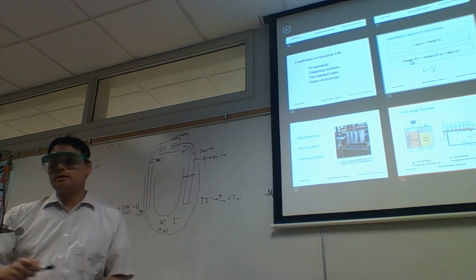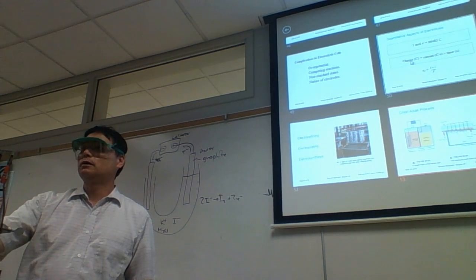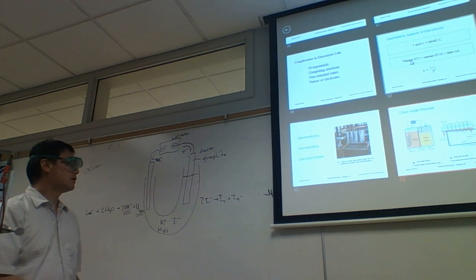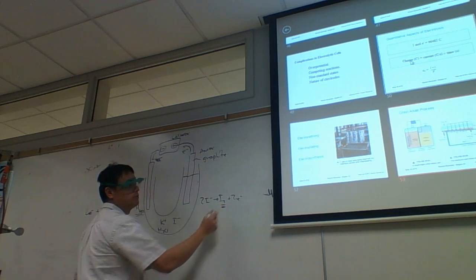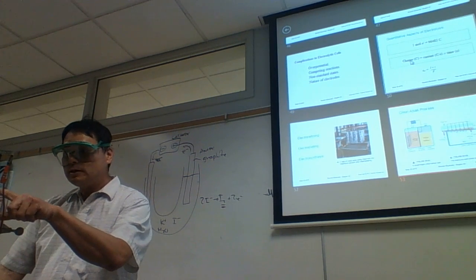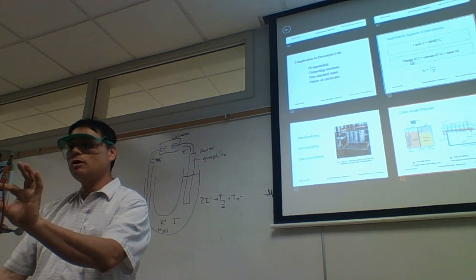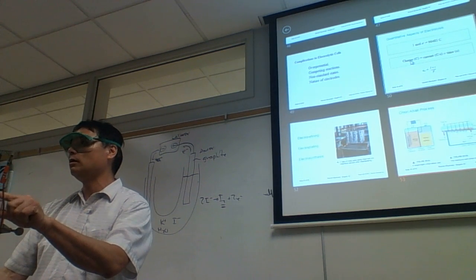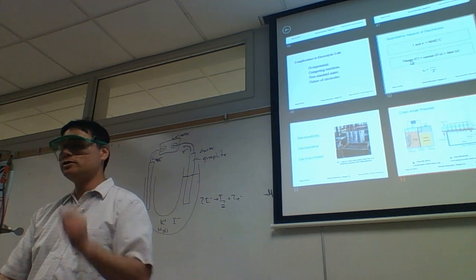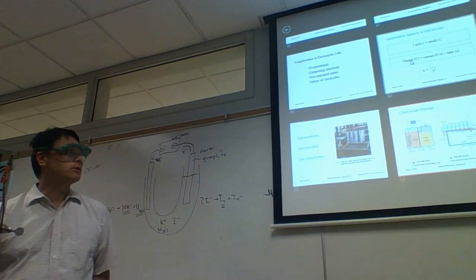That's harder for you to see, but I see it. There are lots of bubbles coming off the electrode. Those are bubbles of hydrogen gas. And so over at the right-hand electrode, we should be forming iodine. Iodine's purple, but when it's diluted, it looks brown. Do you see all the brown solution in here? As it becomes more and more concentrated, it'll become more and more purple. So here we're forming iodine and hydrogen gas. And so this is electrolysis using our power supply here.